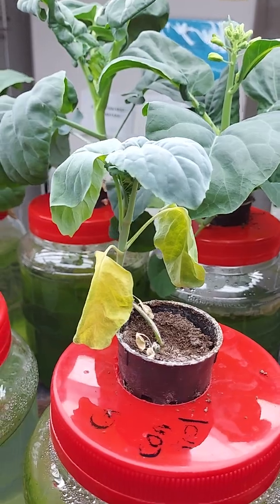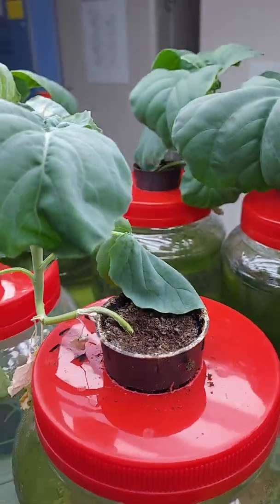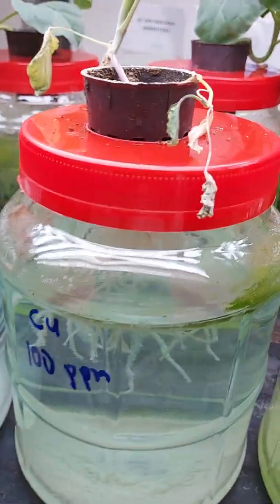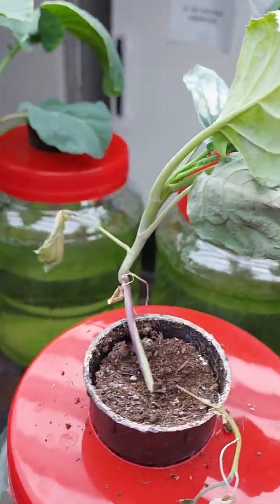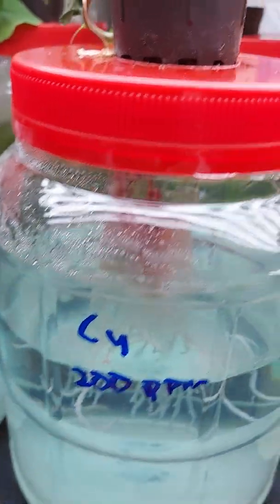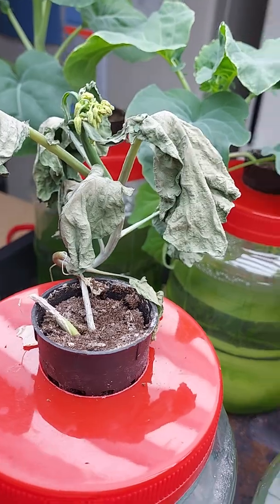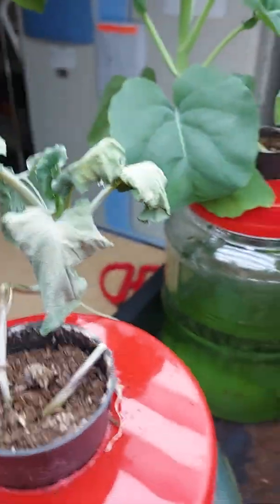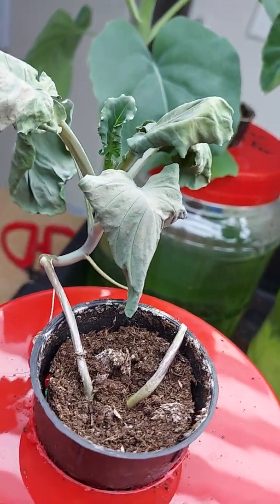We now move on to copper. So in the case of copper, at 10 ppm, there was slight degradation of the leaf quality. However, at 100 ppm, you can see the detrimental effects on the leaves. At 200 ppm, there's an extreme effect on the leaves. So there's almost a shriveling of the leaf margins. And at 500 ppm, again, there is a complete distortion of the leaves. Even the apical meristem appears to be distorted.